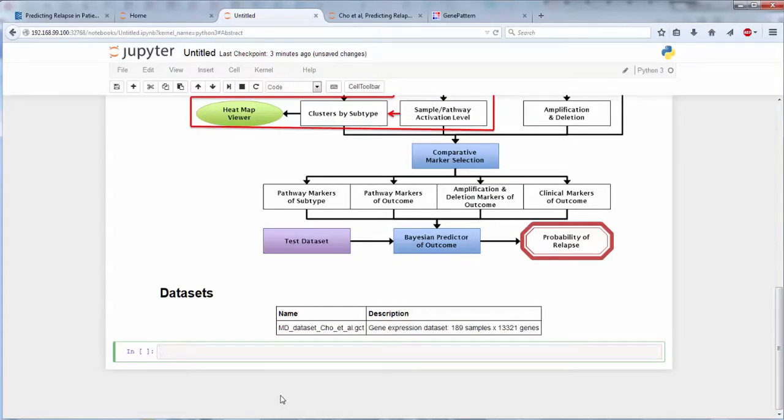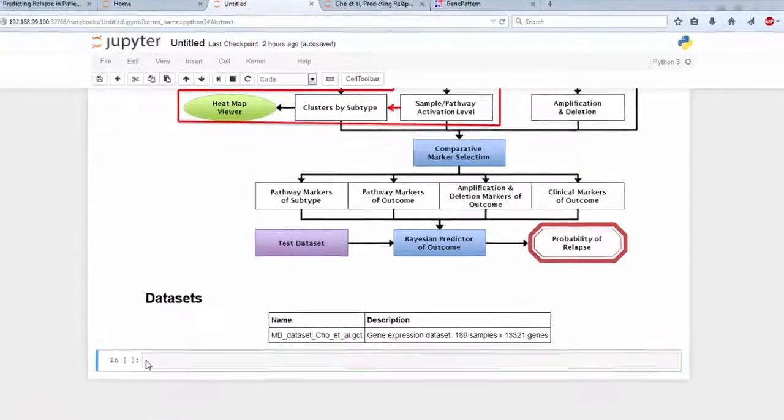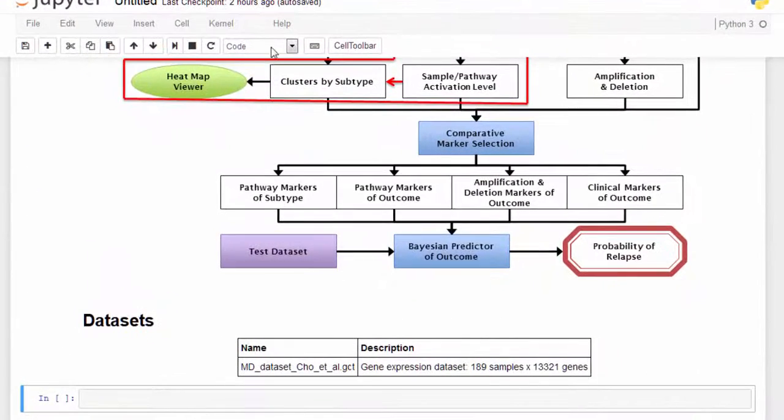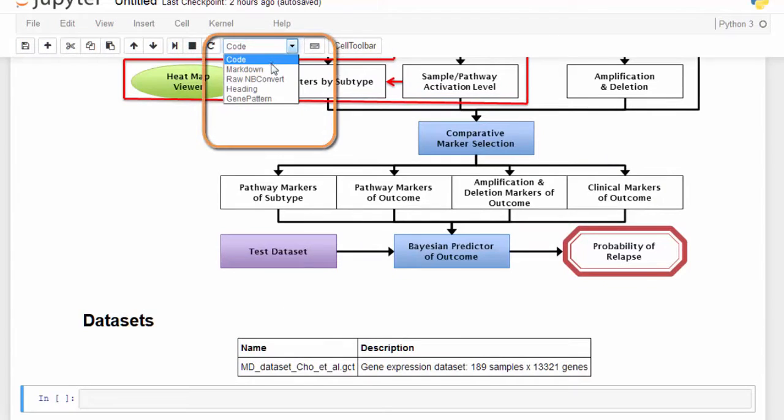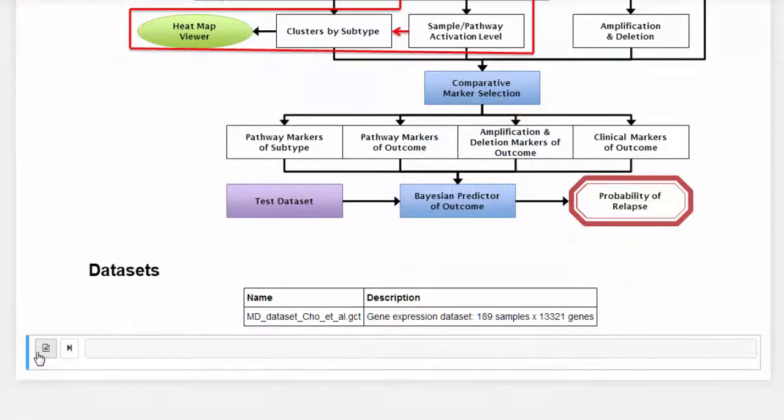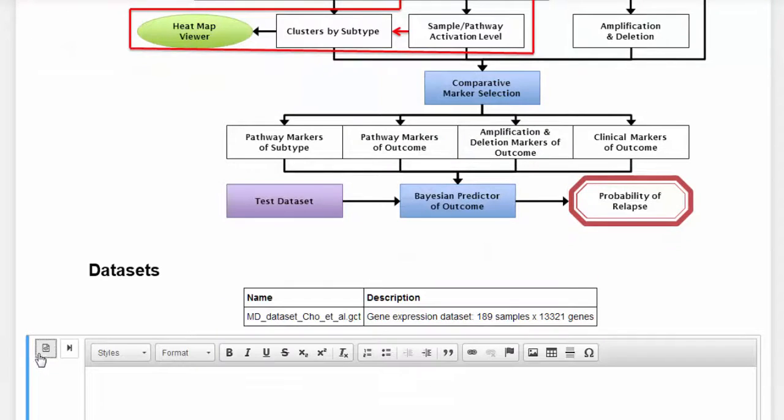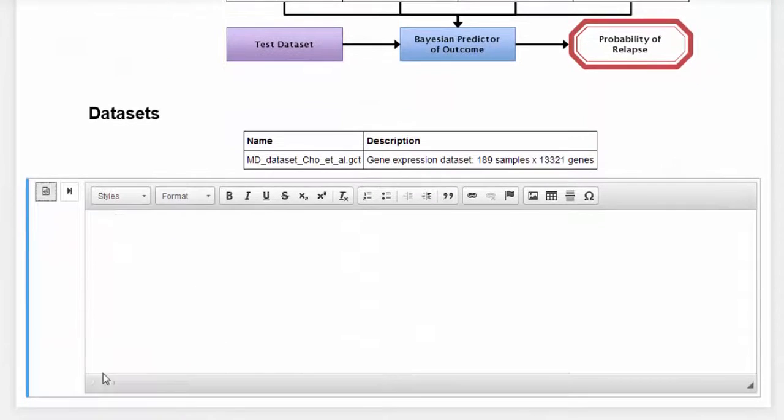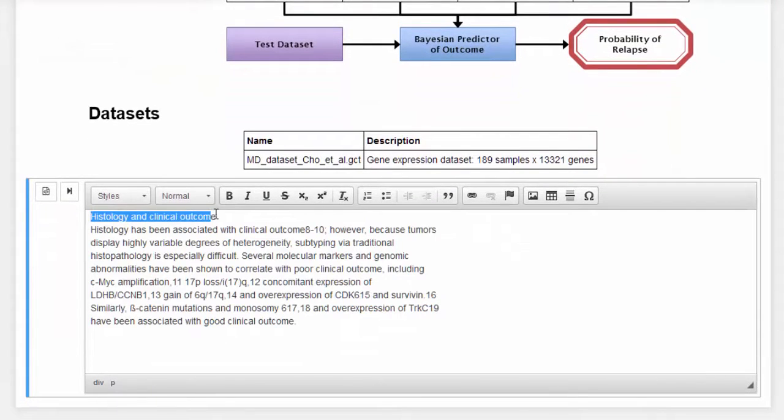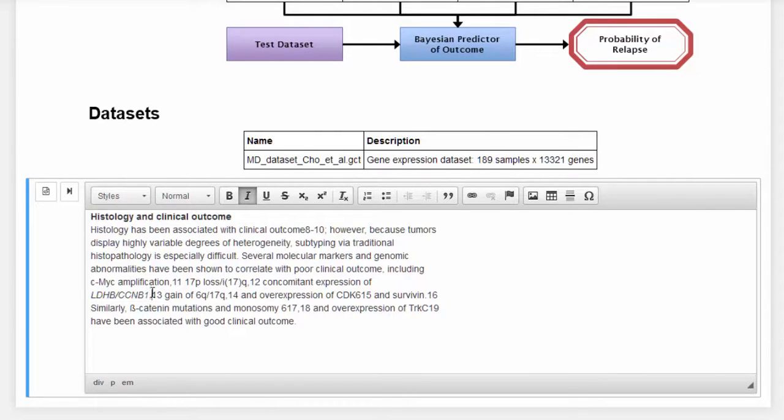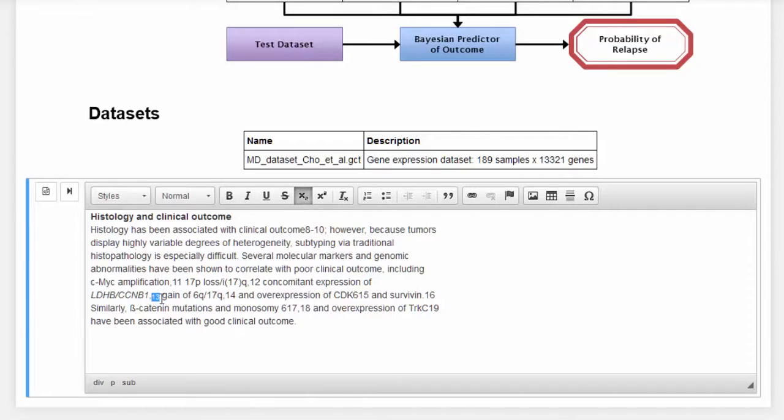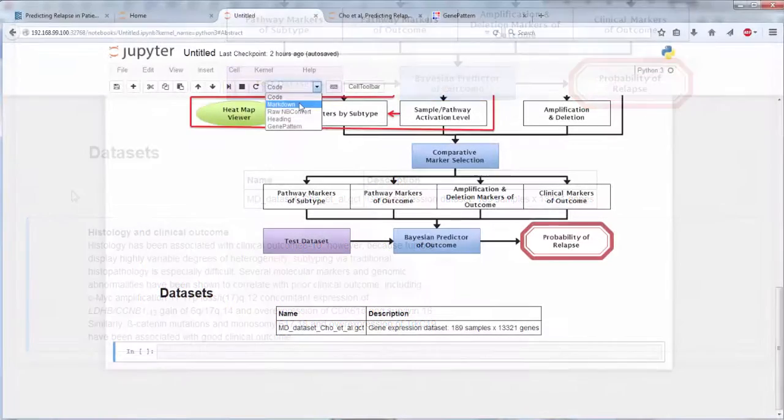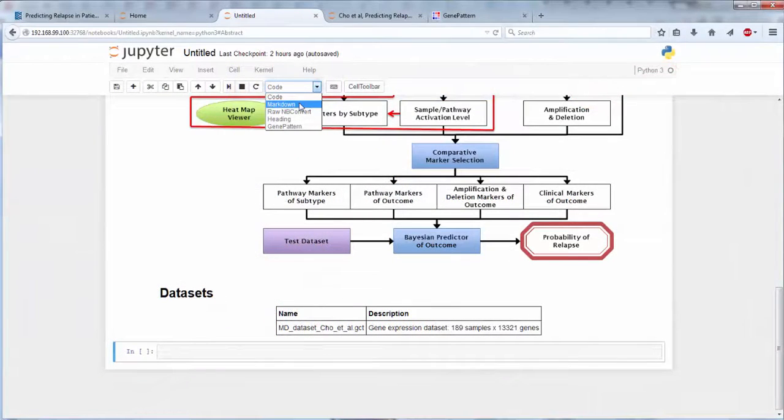The formatting capabilities in Jupyter Notebook are made available through Markdown. With the GenePattern Notebook extension, we have improved upon the capabilities of the existing Jupyter Markdown cell to allow users to create formatted text directly, as they would in a word processing program, without the need to know Markdown.